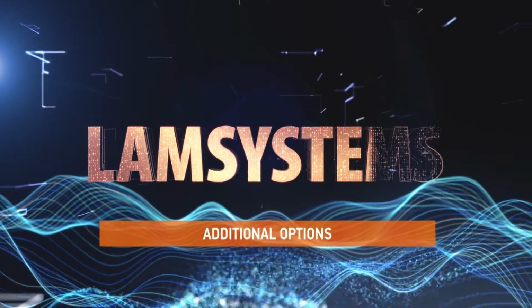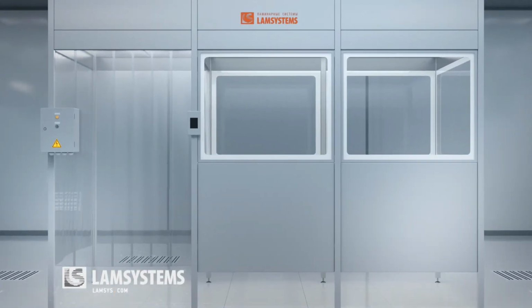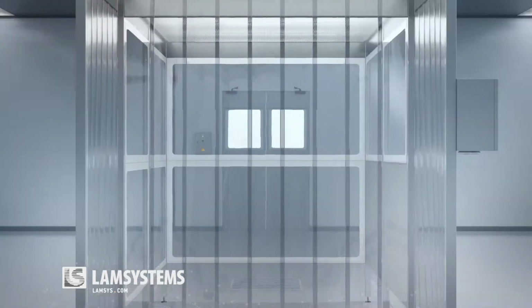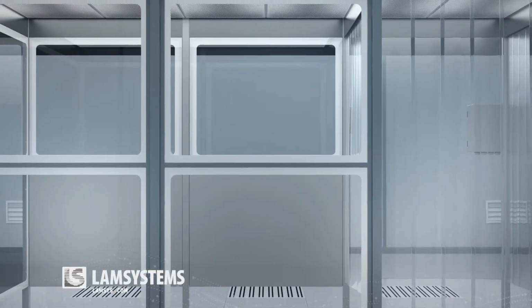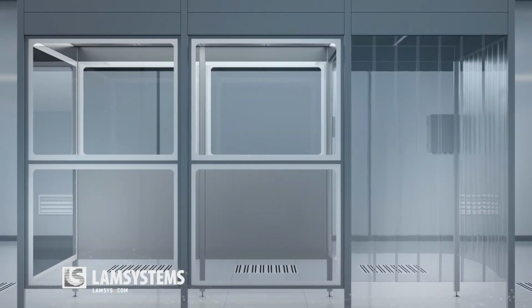Additional options. A clean zone can consist of several local work areas that have a unified control system and adjacent enclosures, a multi-room zone. Moreover, each work area can have its own air cleanliness class, its own lighting, and other functions.